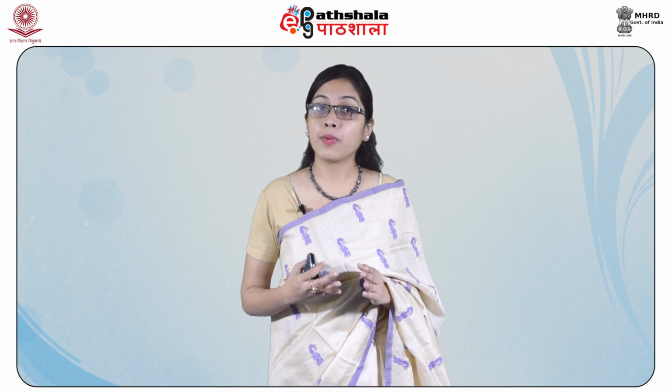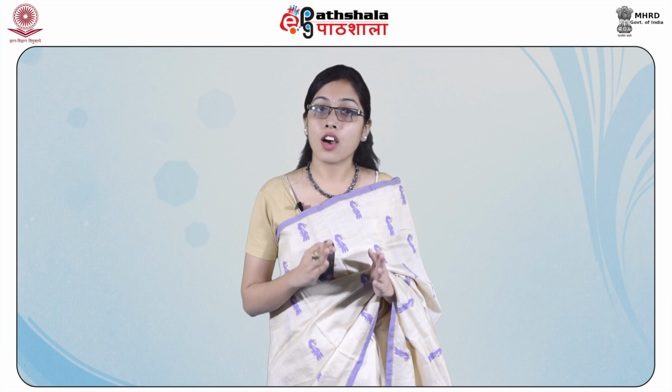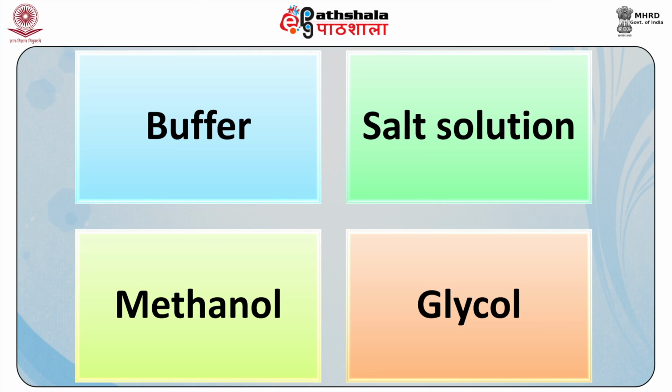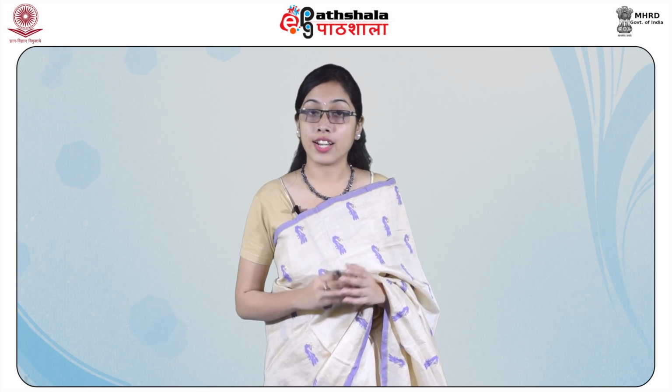The next step is preparation of paper. The paper may be used as such, where water adsorbed in the fibers acts as a stationary phase. Alternatively, paper may be impregnated with a polar solvent other than water such as buffer, salt solution, methanol or glycol. Paper may also be modified with silica, diatomaceous earth and alumina.